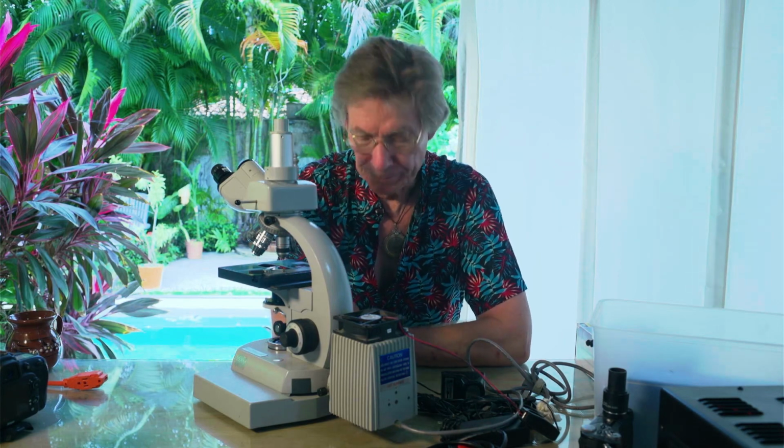And if you have a good technician who can help keep your microscope functioning properly, if it's necessary, that is something you want to make sure is available. So if you're getting a live blood microscope, every major city in the world will have microscope technicians that have the capability to maintain and perhaps upgrade a microscope system, and that is something you want to ascertain prior to purchasing a high-end microscope. I will make a couple of comments about quality.